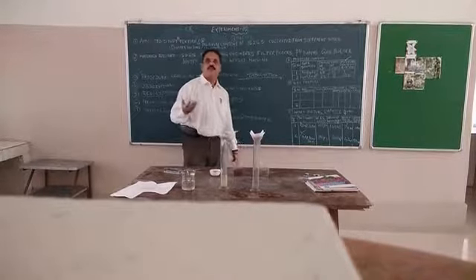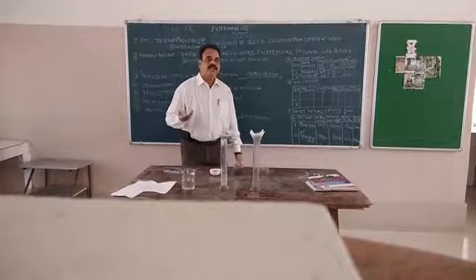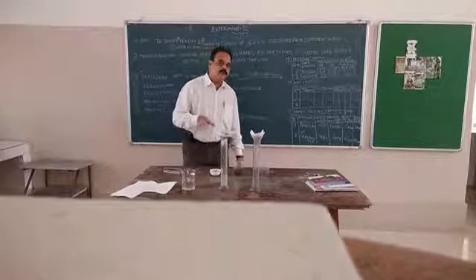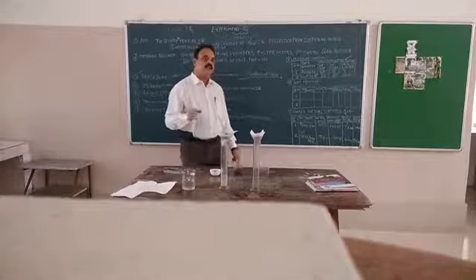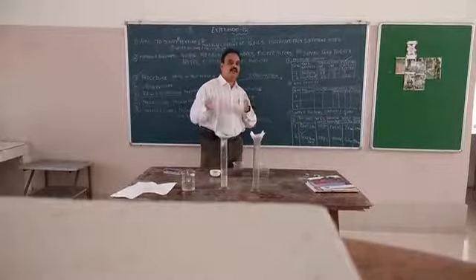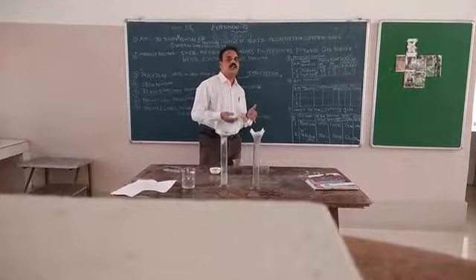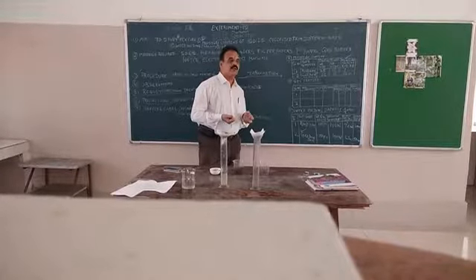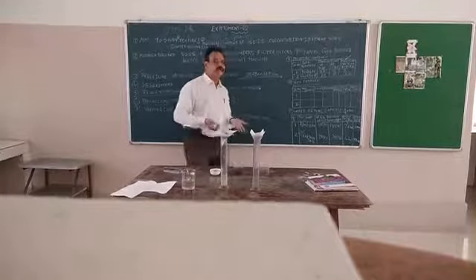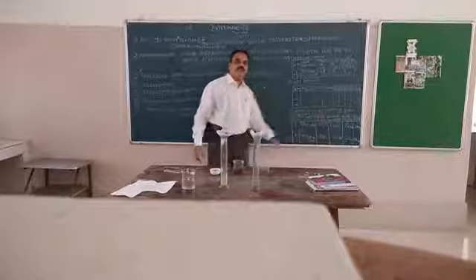Even if the soil is acidic, we can measure how acidic. As all of you know, pH from 0 to 6.9 is acidic, 7 is neutral, and above 7 to 14 is alkaline. The range is normally like 4.5, 5.5. You can test your own soil pH also when you bring the soil sample from your home to school. Similarly, alkalinity can also be measured. We have a measuring pattern where we can measure alkalinity like 8.5, 9.5.